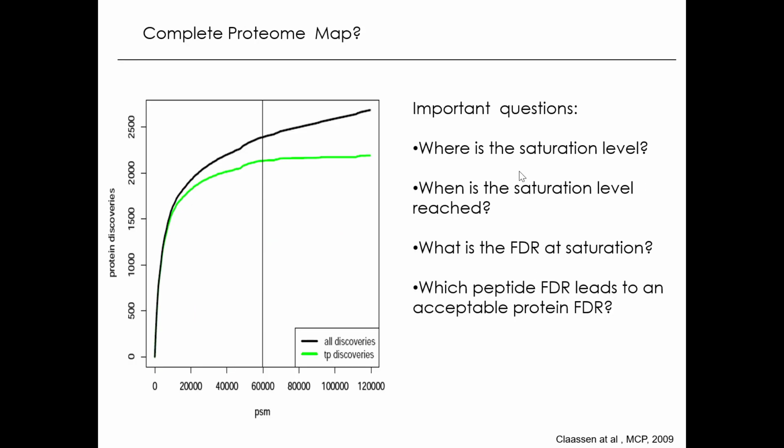So the upshot is that if one does this analysis by increasing the number of repeat analyses or peptide spectrum matches, basically adds data to the large data sets, you will eventually see a curve of protein identifications that starts creeping up. Eventually it hits 100% of the proteome, whereas the true positives will cap out and basically will not increase.